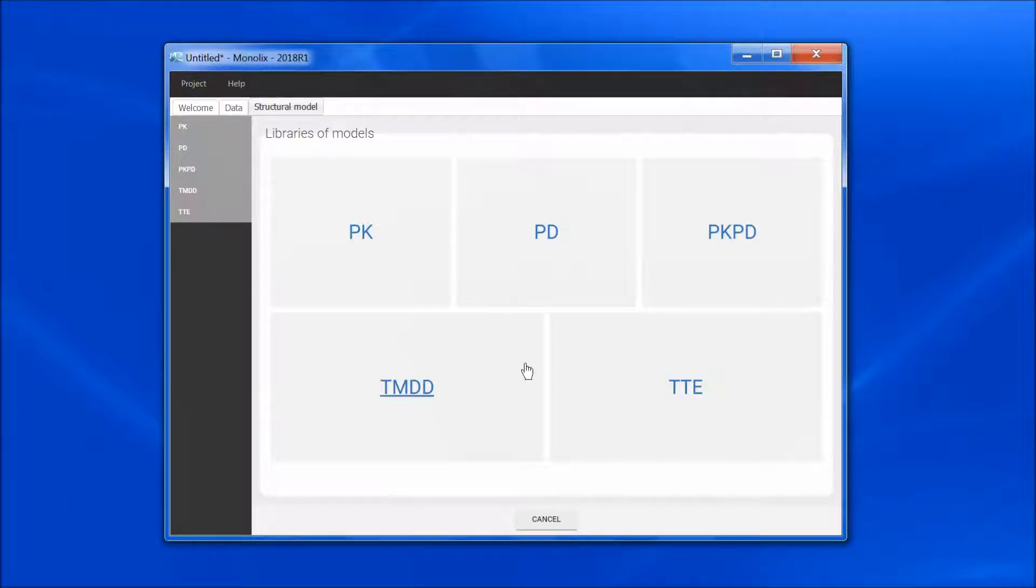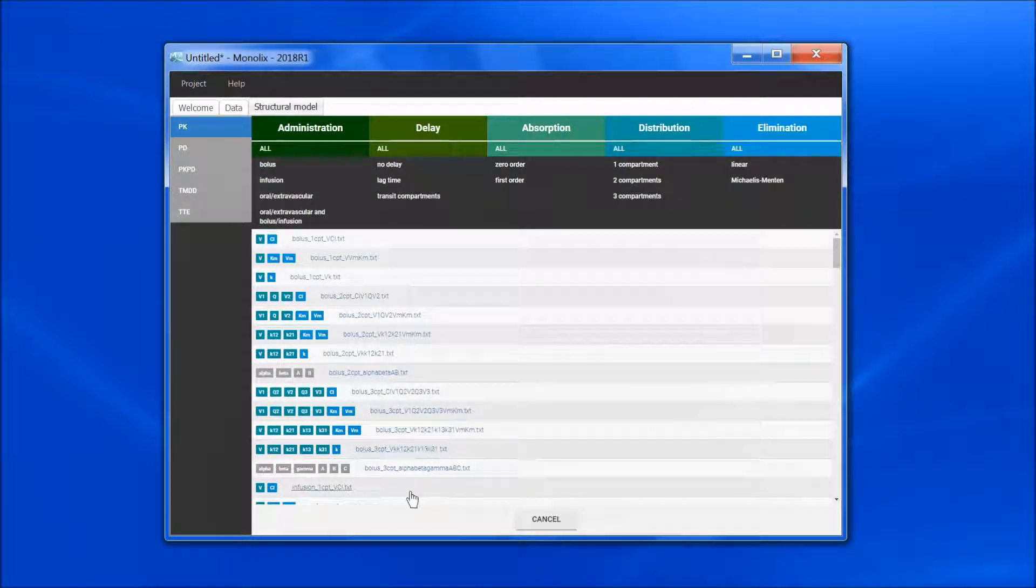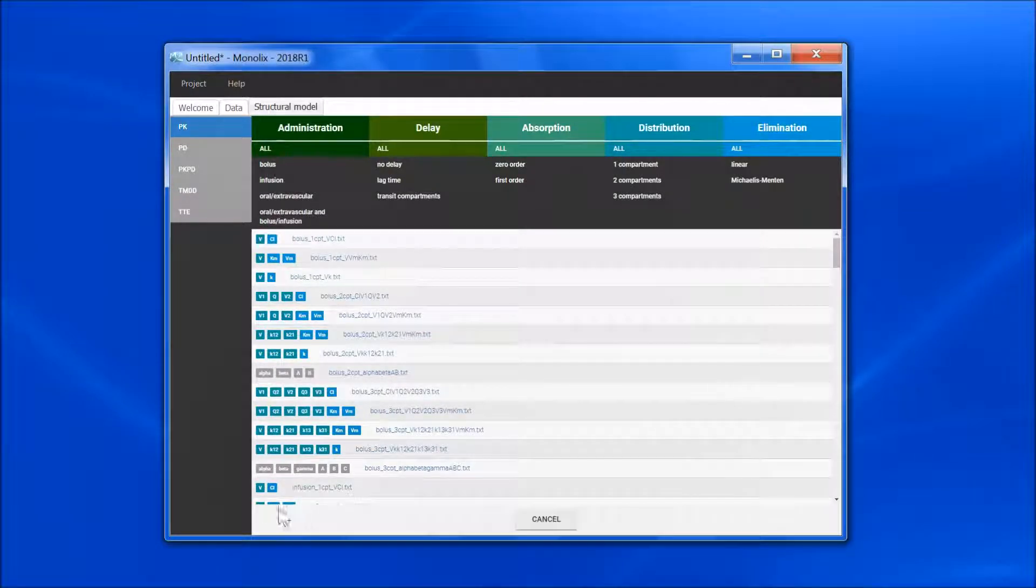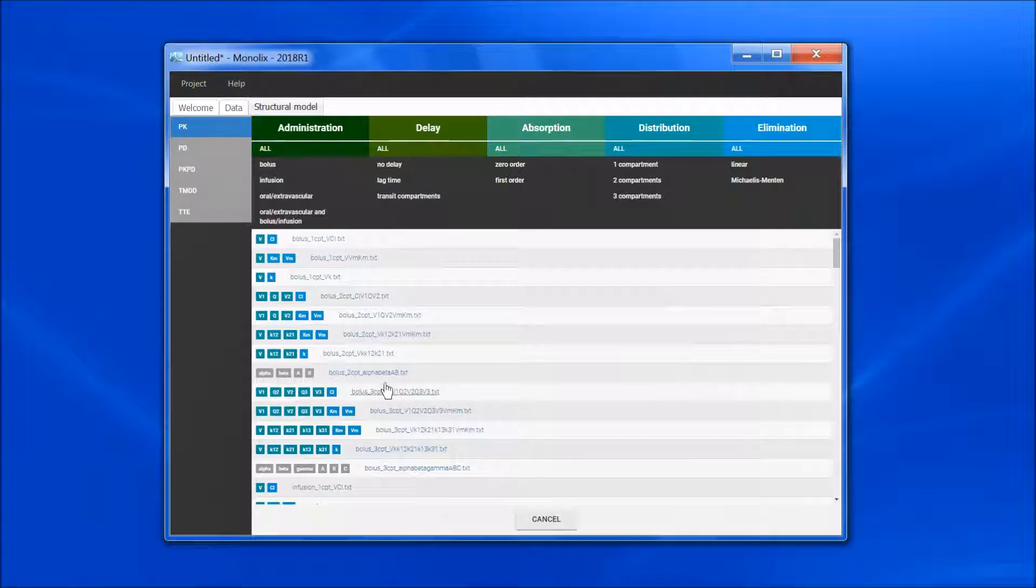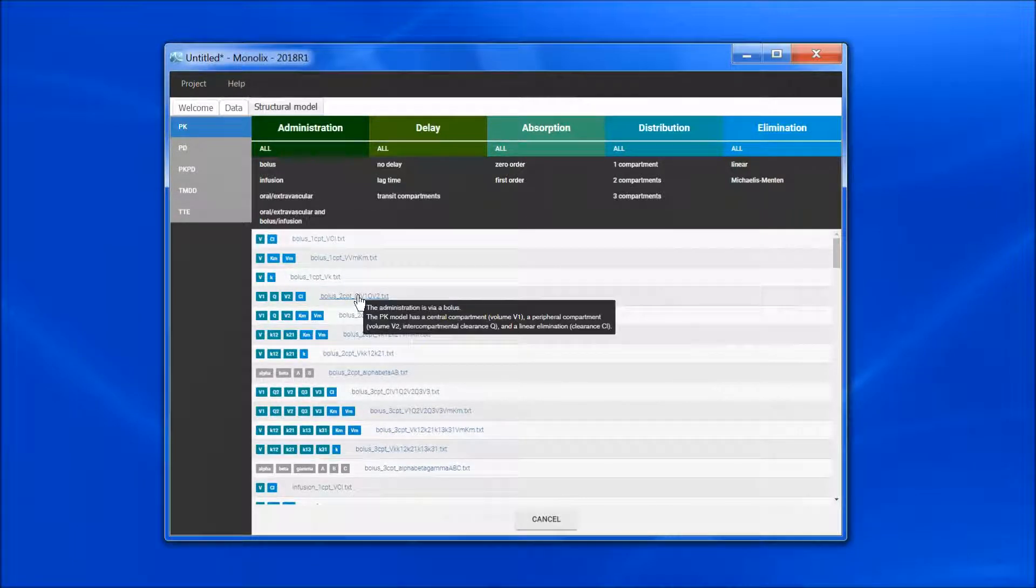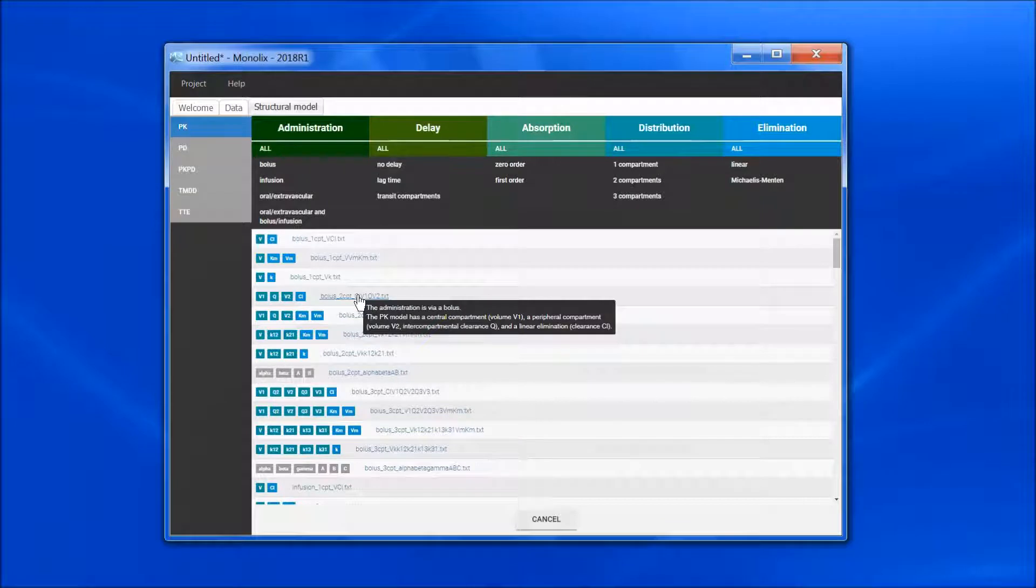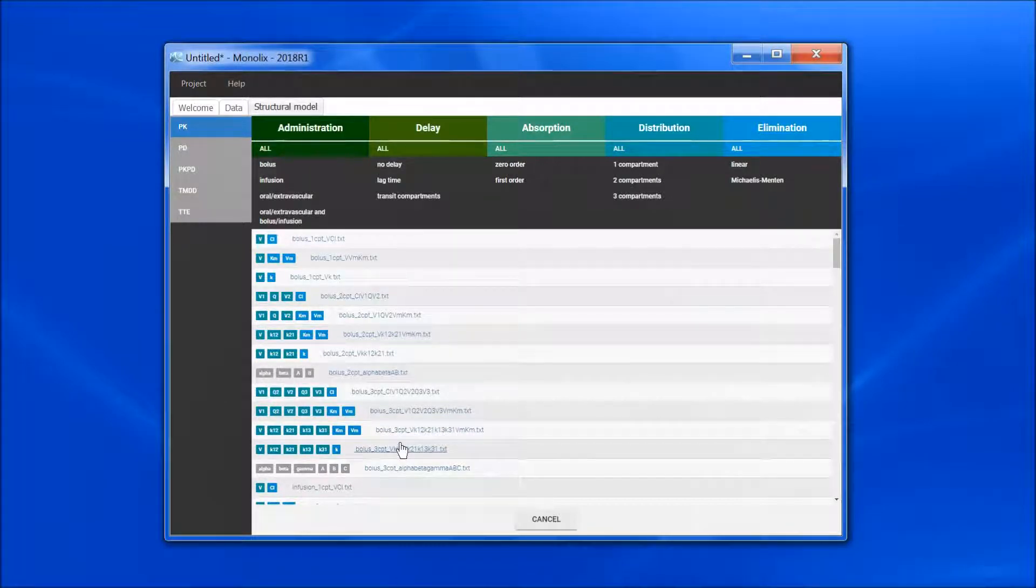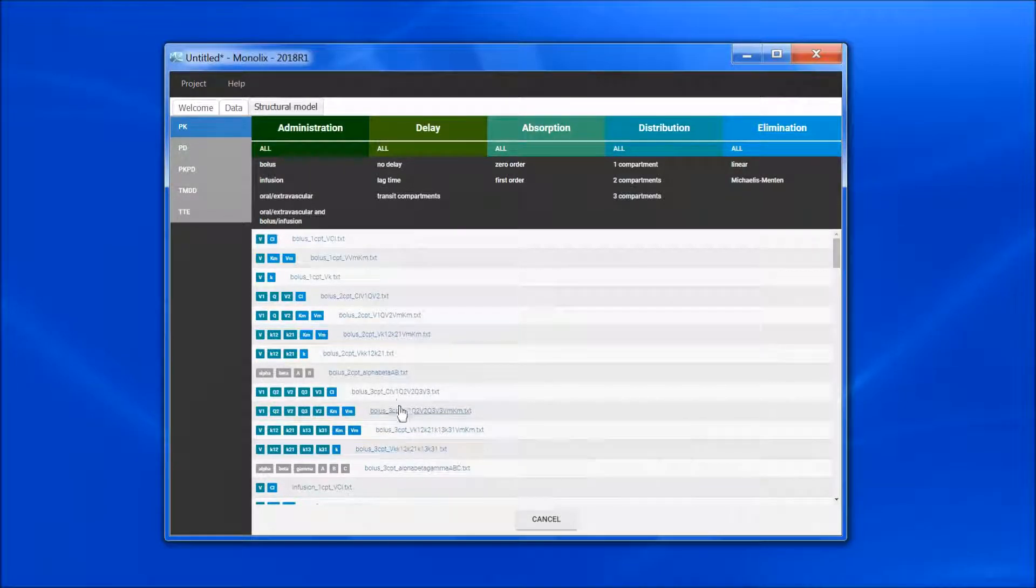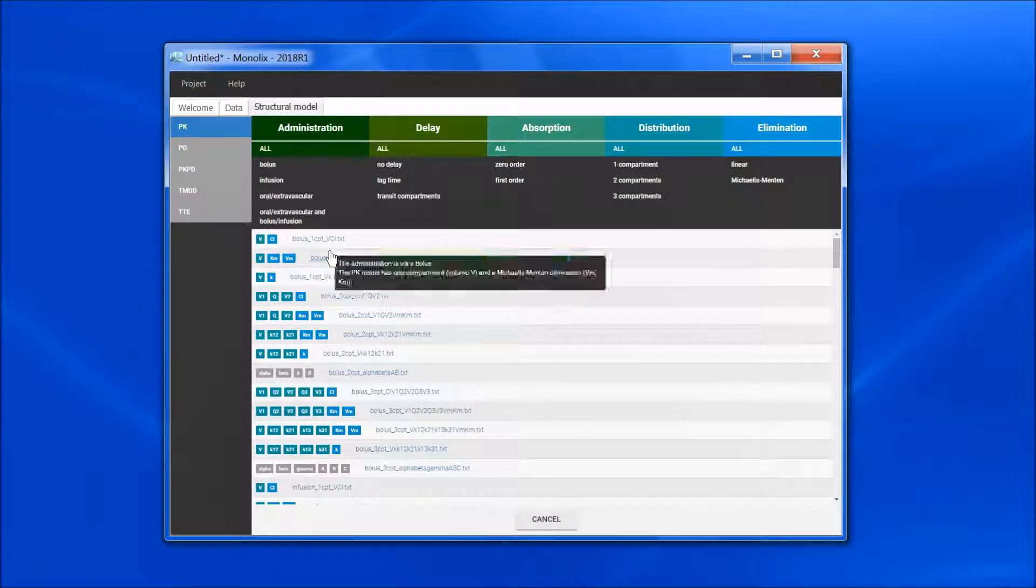Let's have a look at the PK library first. I have a list of models, and on the left side, I can see the parameter names. If I leave the mouse on the file name, I can see a short description of the model. I can directly pick from this list, but it is more convenient to use the filters at the top.